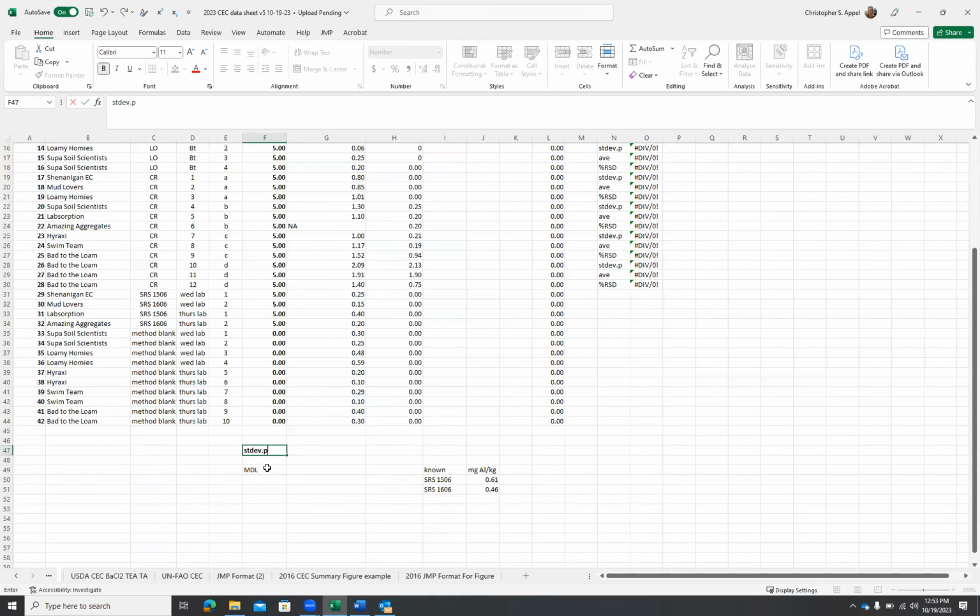All right, do you see that we have a little problem also? See our problem here? So we have more exchangeable aluminum than we have exchangeable acidity, which doesn't give me a lot of confidence in our determination of aluminum. So my assumption then is that these titrations are off, right? Where we have those negative numbers, those titrations are off because I can't reckon that. Oh, I'm just gonna get rid of it.